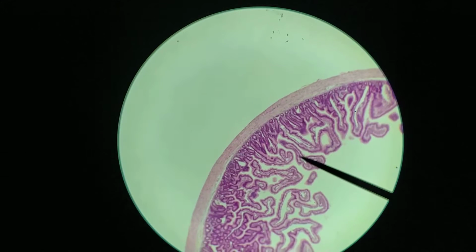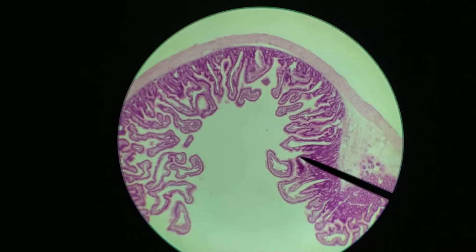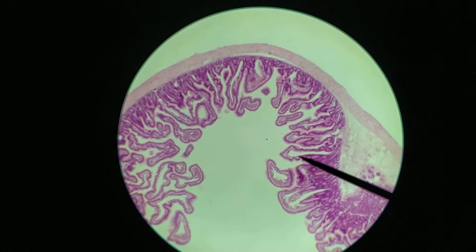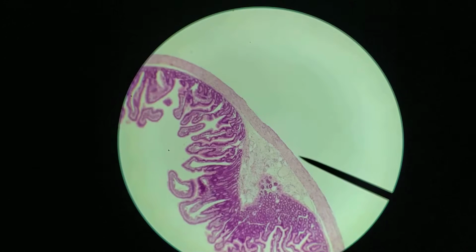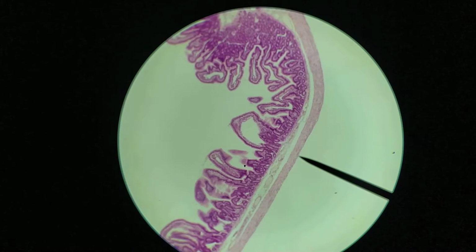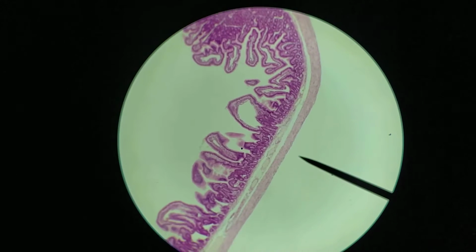Okay, so again, these are not just free-floating things. These are actually attached somewhere. They just happen to be detached in this particular section. So these are the villi, valves of Kerckring, tunica submucosa here, tunica mucosa here, and tunica muscularis out here. And again, on the surface, we have a free surface on the outer surface. So we're going to have a tunica serosa, which is going to be mostly just a simple squamous epithelium or mesothelium with a little bit of connective tissue underneath it.